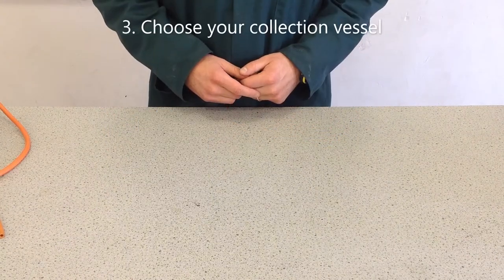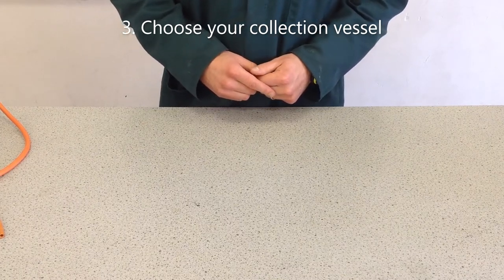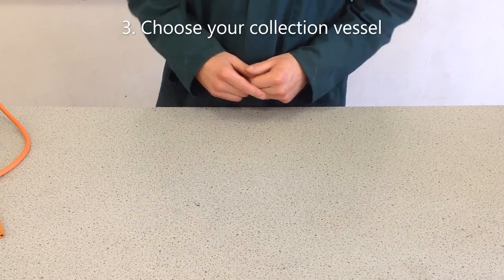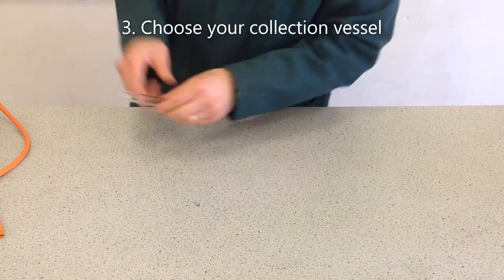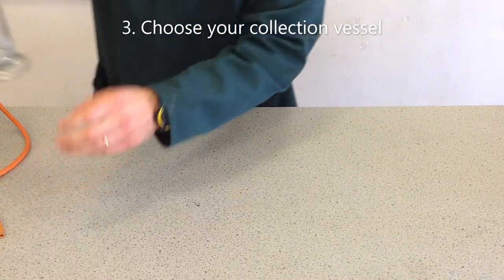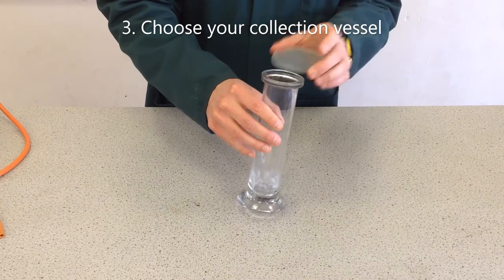The choice of the collection vessel depends on what you want to use the gas for. If you're interested in collecting the gas to use it, and you don't have very much gas, you can use a test tube. Or if you've got a larger volume of gas, you can use a gas jar.